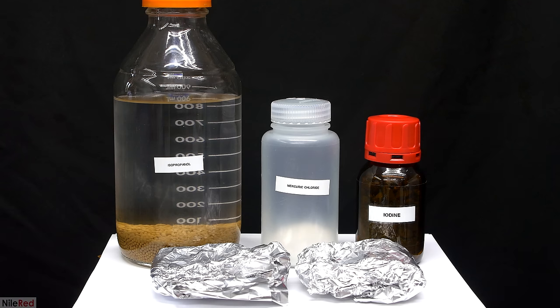To prepare the aluminum isopropoxide, we need isopropyl alcohol, mercuric chloride, iodine, and aluminum foil. In total, I used about 300 milliliters of isopropanol, 0.2 grams of iodine, 27 grams of aluminum foil, and 1.65 grams of mercuric chloride.